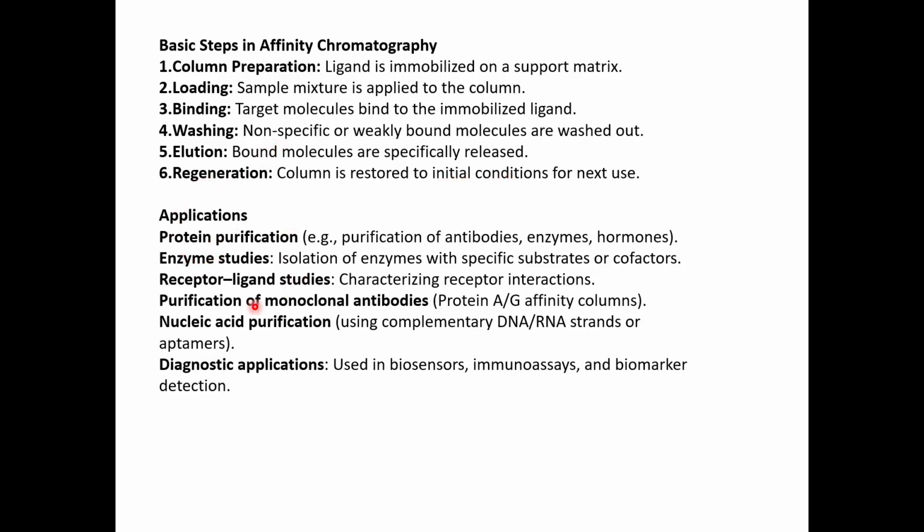So there are several applications of affinity chromatography. We can do protein purification to get pure forms of proteins like antibodies, enzymes, hormones, etc. And then we can use it for enzyme studies where we want to isolate the enzymes with specific substrates or cofactors, and then receptor-ligand studies can be done. We can characterize the interactions between the proteins, and then purification of monoclonal antibodies, of course, using protein A/G affinity columns, and then nucleic acid purification.